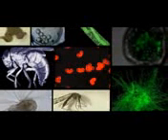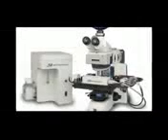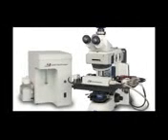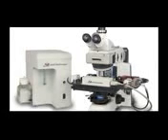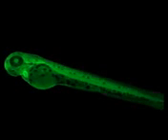Union Biometrica develops tools for model organism research. VAST BioImager system is a tool for researchers who need to capture still or video images of large numbers of 2 to 7 day old sedated zebrafish larvae. By automating the handling of larvae prior to imaging, VAST avoids the time-consuming and tedious steps of manual manipulation of larvae for large dataset image acquisitions.